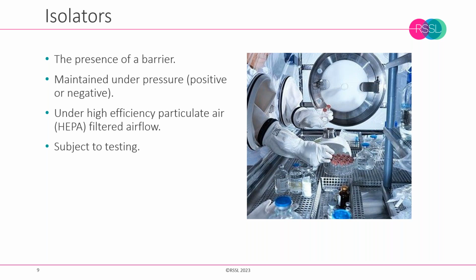And in terms of maintaining the barrier, either we have a solid wall, or there are some examples of flexible wall isolators that are less common these days, but they were certainly part of that first wave of when isolator technology appeared in the late 1980s.